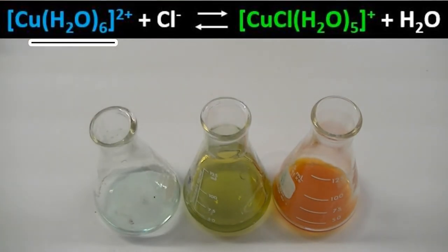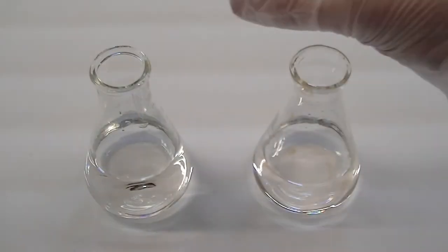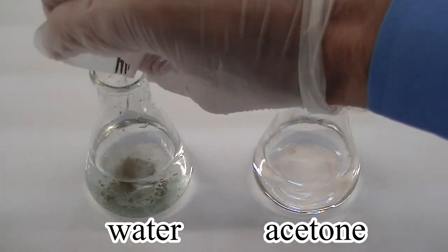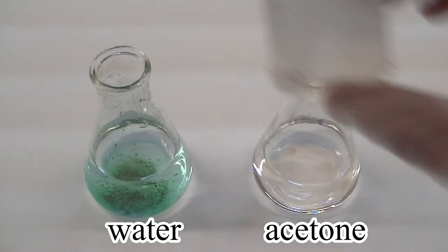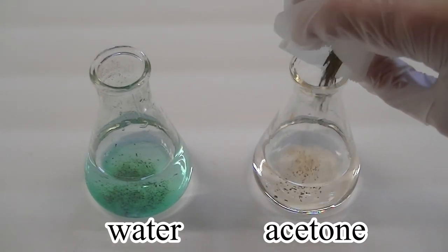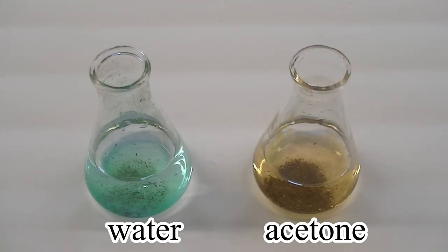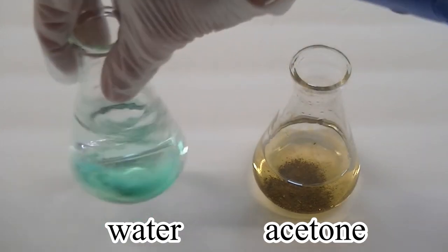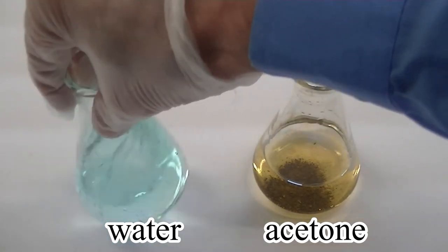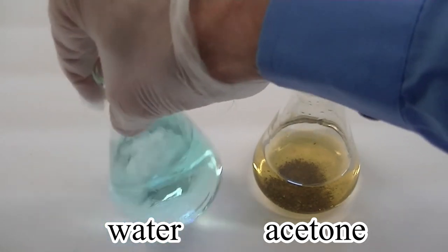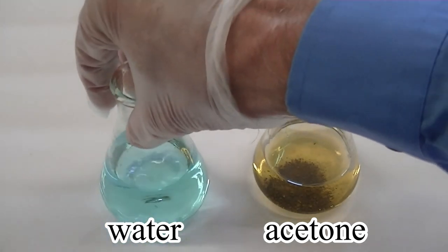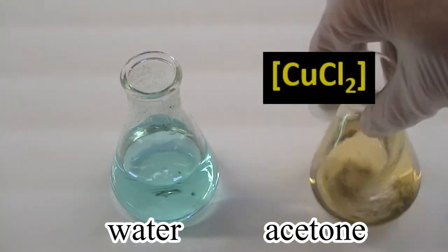Now we're ready to explore the color difference observed when anhydrous copper-2 chloride is dissolved in water and acetone. The compound appears blue in water, but yellow-green in acetone. Because the compound contains two chloride ions for every copper-2 ions, it makes sense that the dichloro-copper species, which is yellow-green in color, should form. This is certainly what's seen in acetone.